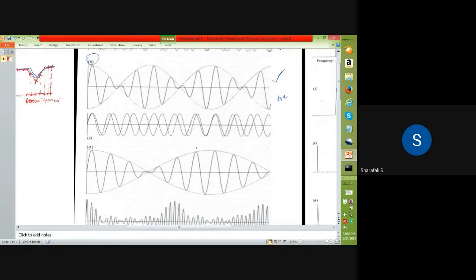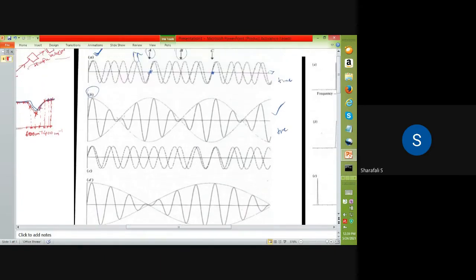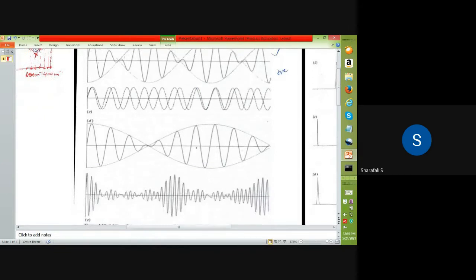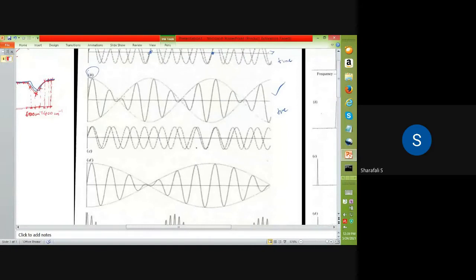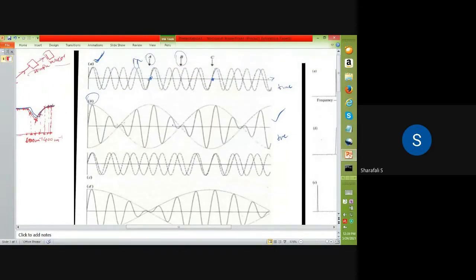And if you consider waves with a larger phase difference, half phase difference in those frequencies, then we have a different kind of spectrum. You can see this will produce some beating effect here, and this beat is repeated in time, like that.